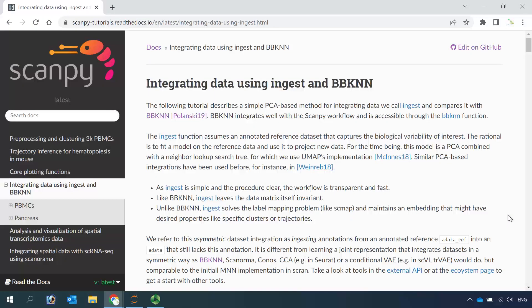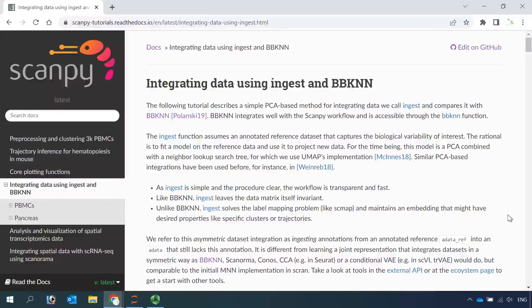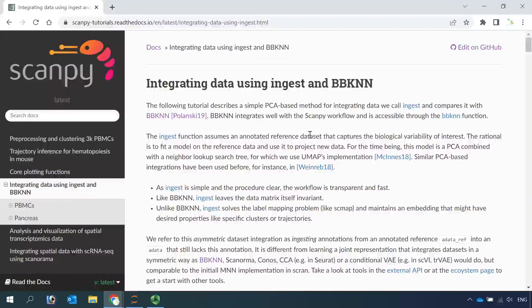Hello everyone. Welcome back to my video tutorial for single-cell RNA sequencing data integration in Scanpy. In my previous video, I showed you how to integrate a dataset using BBKNN. Today I'm going to show you another method called ingest for data integration. You can read the details about the ingest function from the online Scanpy data integration tutorial.